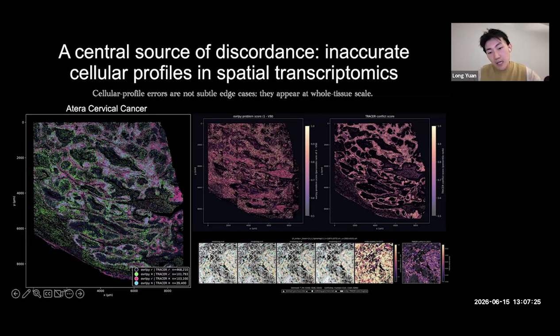So here in the instance of the Z-stack series, you can see that this region, which has a dominant gene expression program of T and NK cells characterized by the CD3 family gene expression, is also concurrently expressing genes that are only restricted to the myeloid lineage, such as the canonical marker gene CD68.